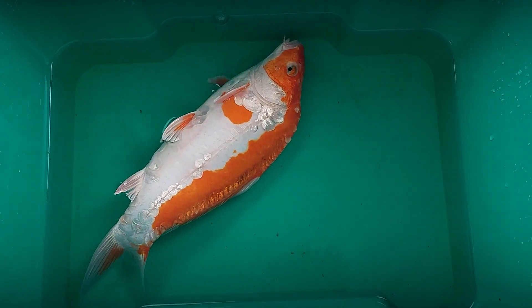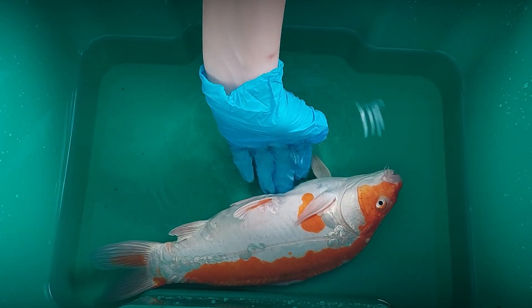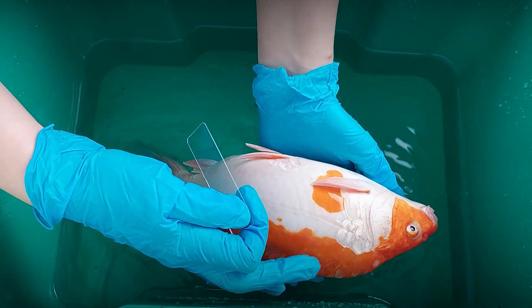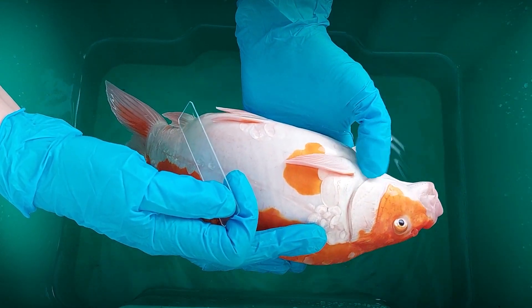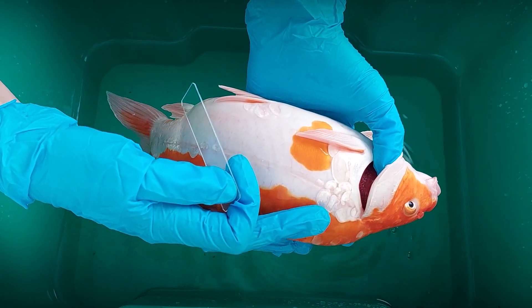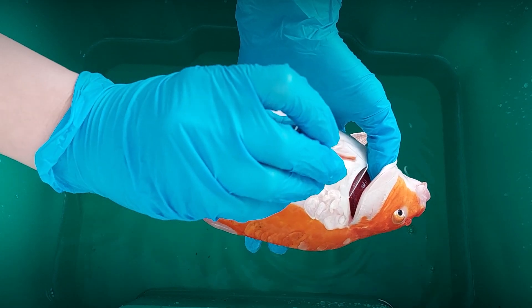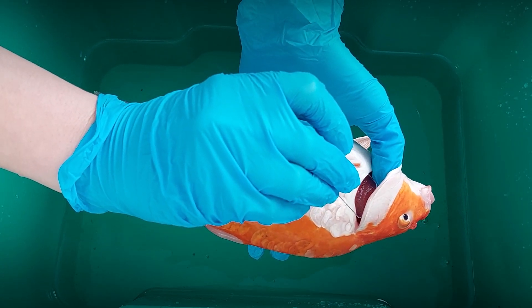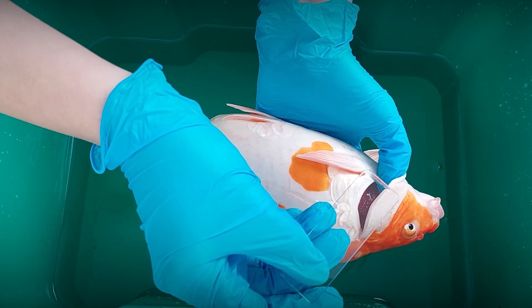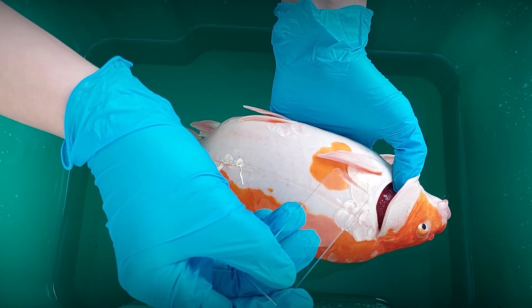Carefully set the slide aside and take a new slide for the gill biopsy, if you also want to examine the gills. Hold the fish in one hand and gently open the gill cover with your finger or with your other hand. Insert the slide into the gill area, holding it parallel to the gill cover, then carefully scoop out a small sample by scraping over the gill tissue.